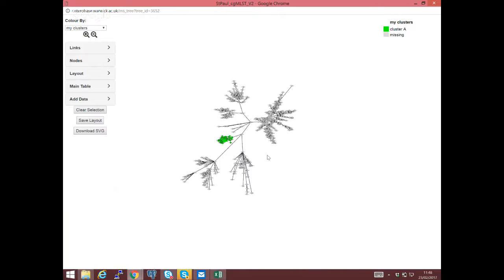However, in the comparisons we've done of SNPs that are cleaned up for recombination, for data sets where we are fairly certain about the genealogy, and we visited with cgMLST, we find that cgMLST is quite robust to recombination. Secondly, the question was, is it the same for mapping-based SNPs? So the SNP trees are not filtered for recombination. That is the core genome SNPs according to the reference you define. We don't filter for recombination yet.